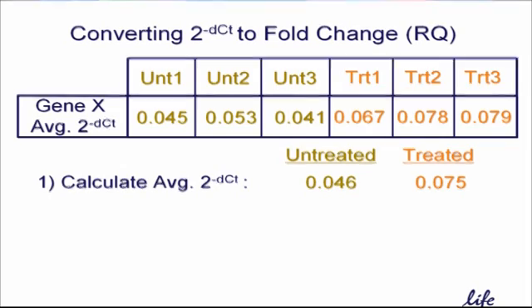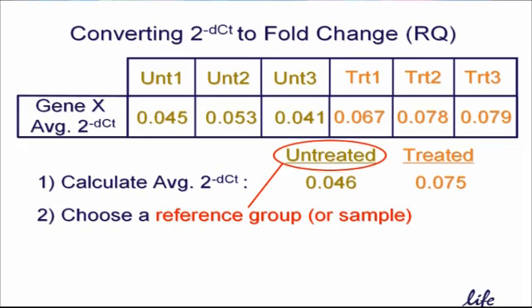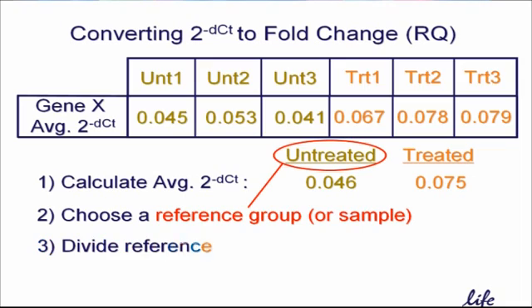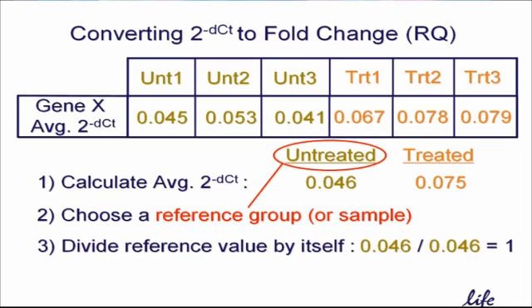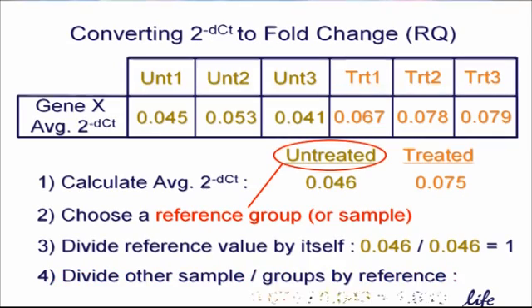Next, the user chooses a reference sample, and actually you might recall that the user does this when he or she changes the analysis settings. We'll say that the untreated is our reference group. DataAssist then takes the reference value and divides it by itself, such that it has a final value of 1. Finally, DataAssist divides each other sample's value by the reference value. And that's how the software generates fold changes.